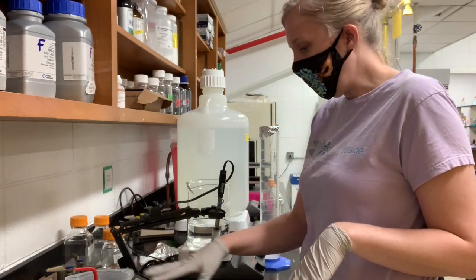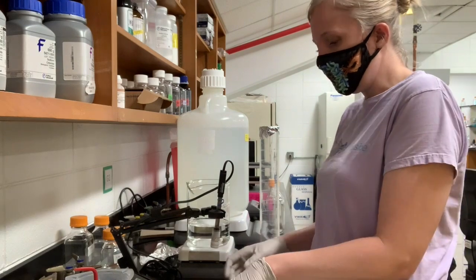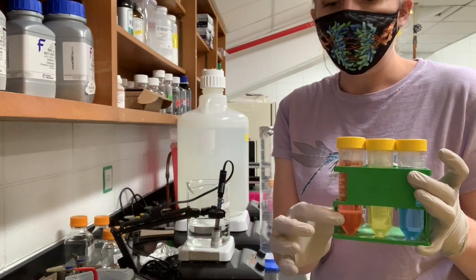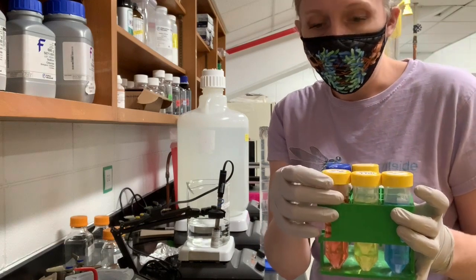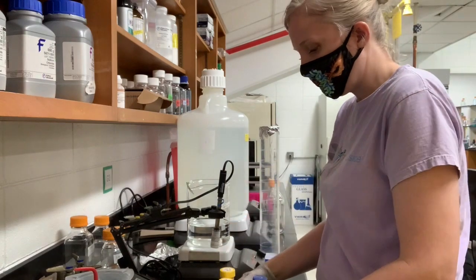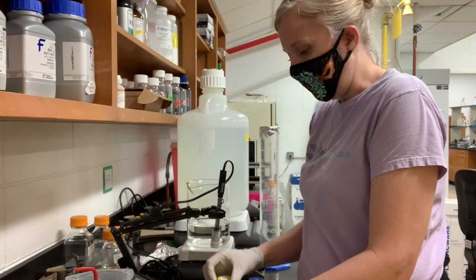And when you come to it, what you'll want to do first is to calibrate it. And so you'll see that there's a little rack with 3 colored liquids. So this one will say pH 4, pH 7, which will be yellow, and pH 10, which will be blue. And you can go ahead and uncap those, but I would leave the caps on. You don't want to get them mixed up.